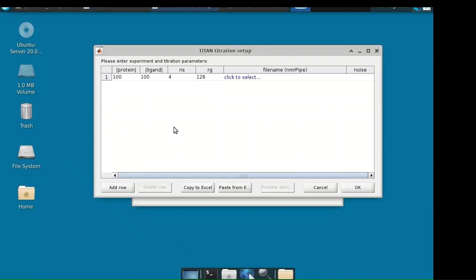Today we'll be analysing one of the many example sets of data you have access to in Titan. This data can be copied and pasted from an Excel spreadsheet for convenience or filled in cell by cell. However, remember that the paste function will overwrite anything currently in the entire table. The columns will depend on the chosen binding model — titration parameters, protein concentration, ligand concentration, number of scans, and receiver gain used in NMR acquisition need to be inputted.